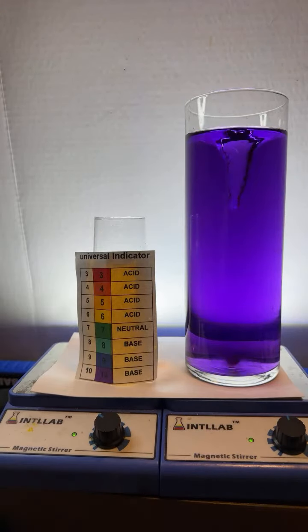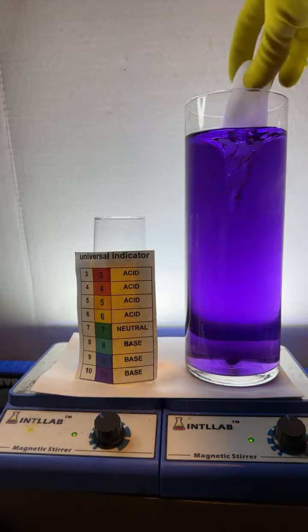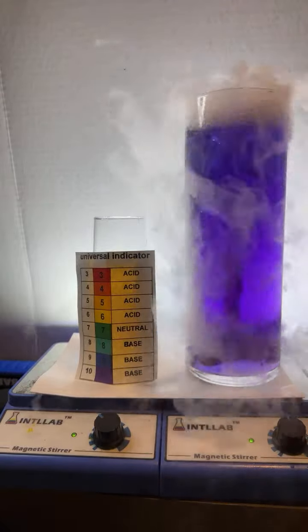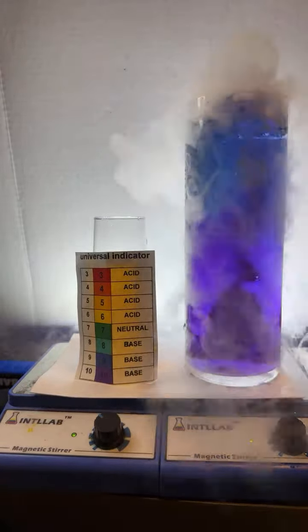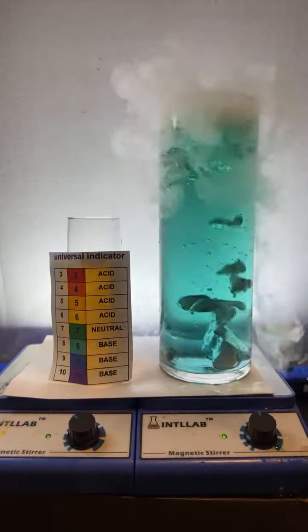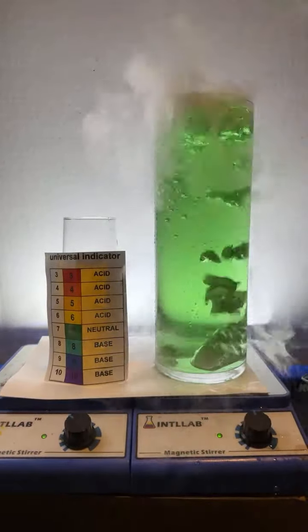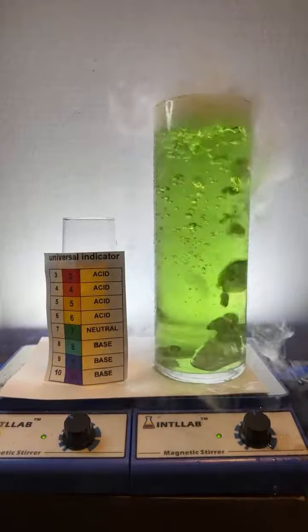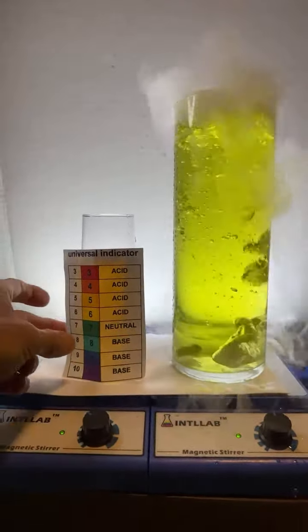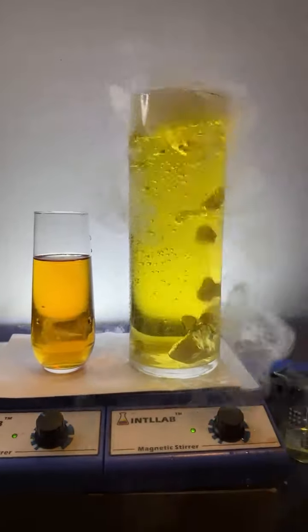How am I going to add carbon dioxide? I'm going to add dry ice. Dry ice is solid carbon dioxide. So in it goes. And as I add that carbon dioxide, look at that beauty. Come on, baby. The pH is dropping. It's pH 8. It's pH 7. And now it is almost there. A little bit more. It's pH 6. So any water that's been exposed to the atmosphere will have carbon dioxide dissolved in it, which is going to make it slightly acidic.